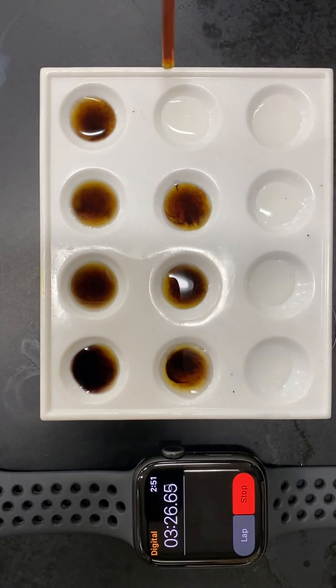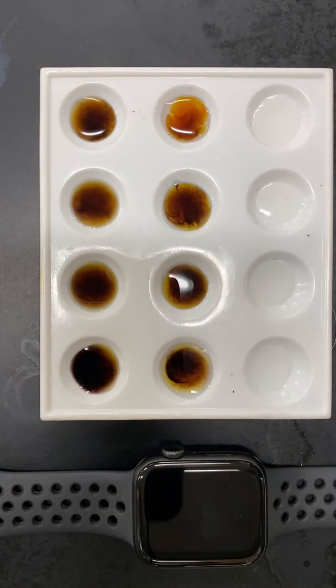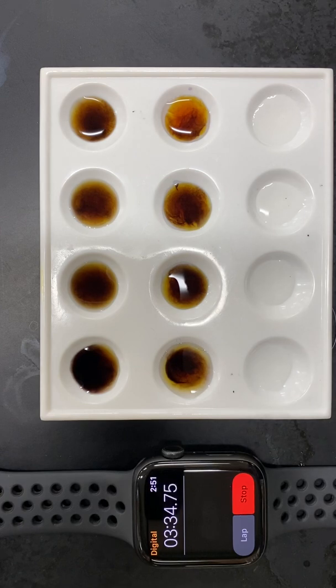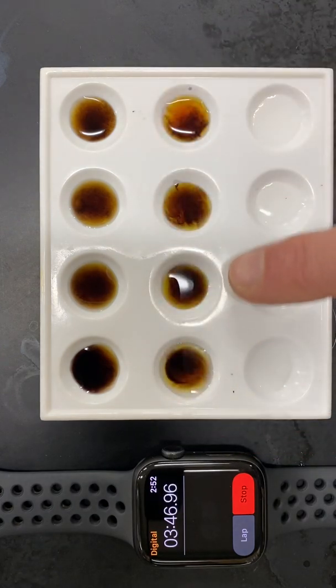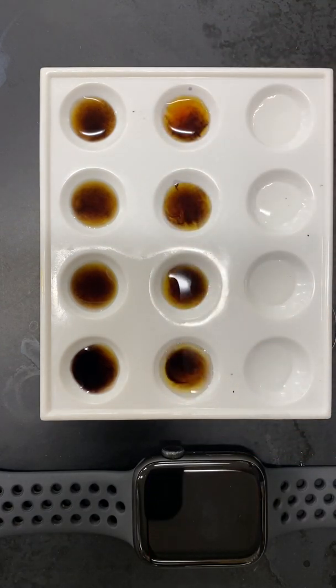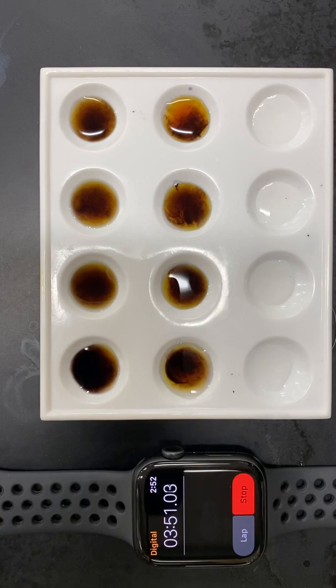Here we go for another one. And hopefully what you're noticing is that the amount of starch, or the amount of dark, seems to be becoming smaller and smaller over time. And that's kind of the point of this particular part.